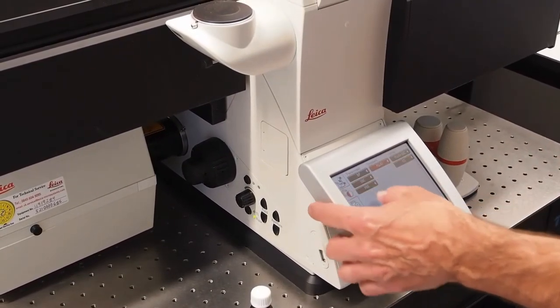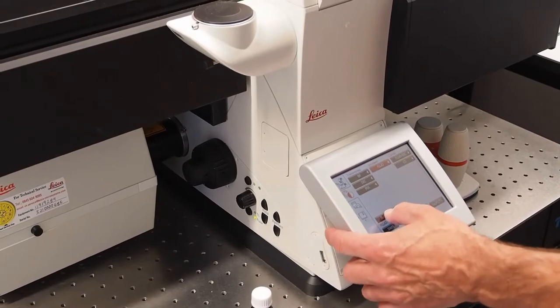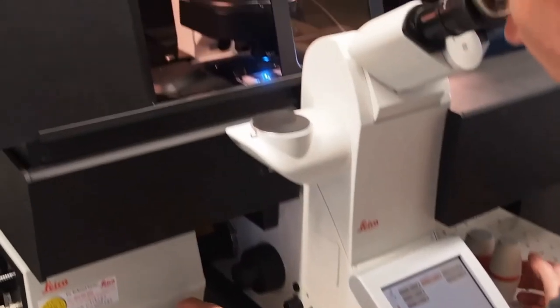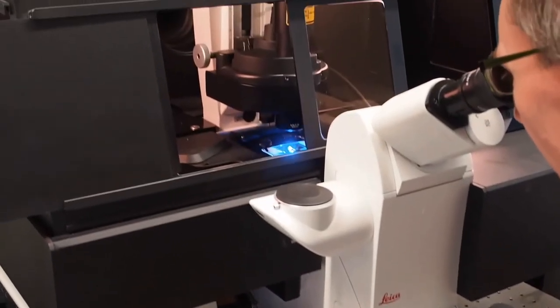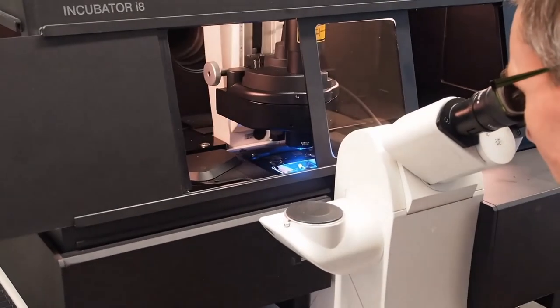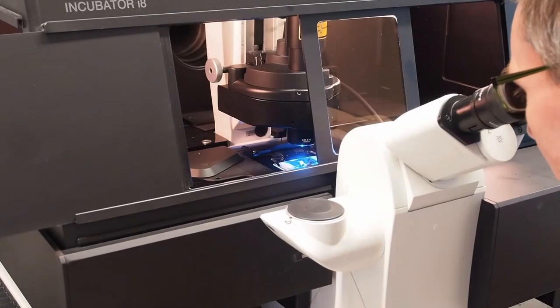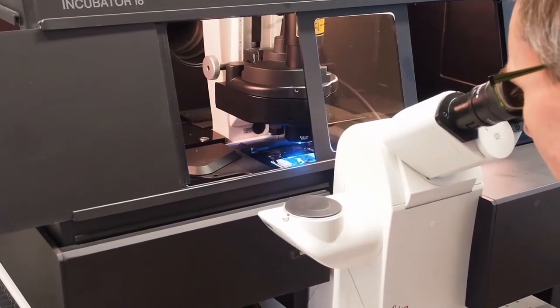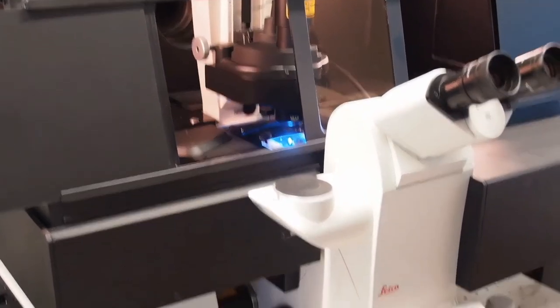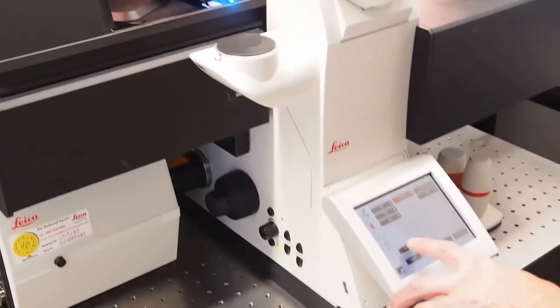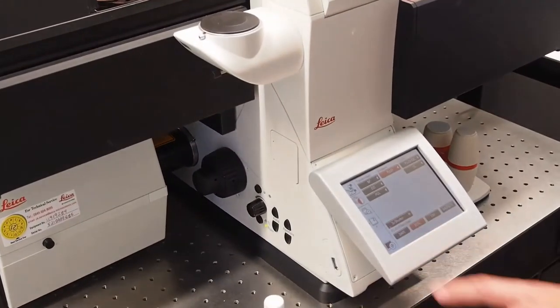Then switch the lamp on and find the focal plane. When finished turn the lamp off.